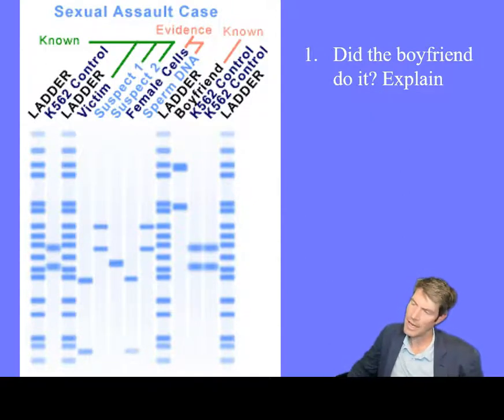So here is a gel electrophoresis. We have some bands here in a sexual assault case. We have the victim right here, and this is showing the victim's bands.